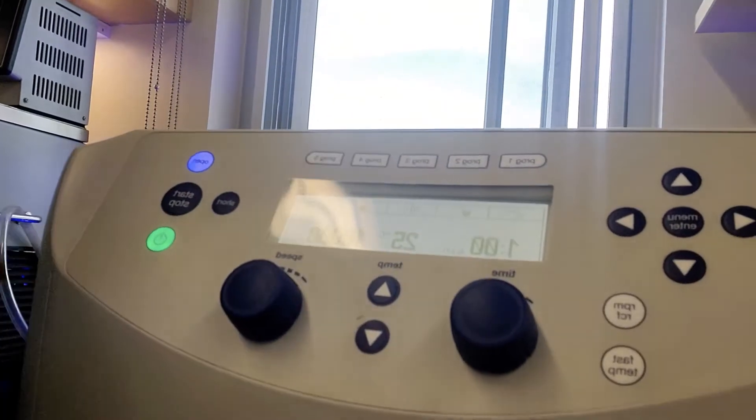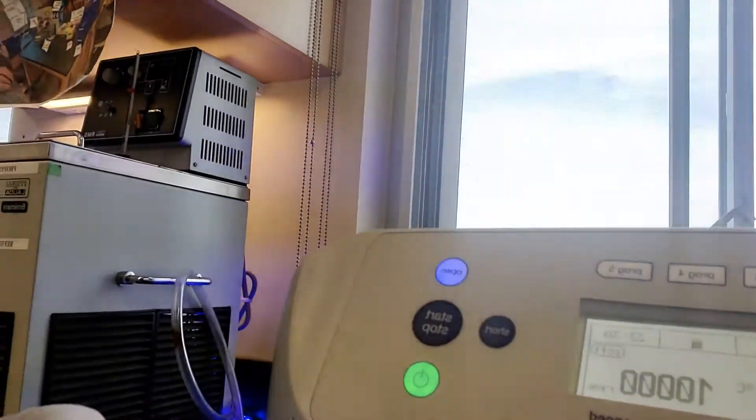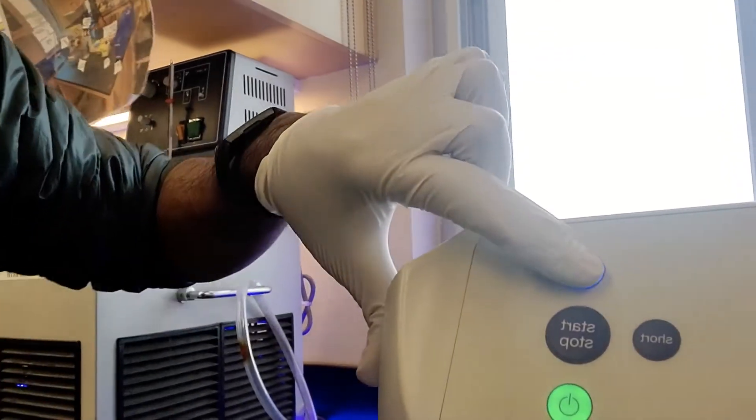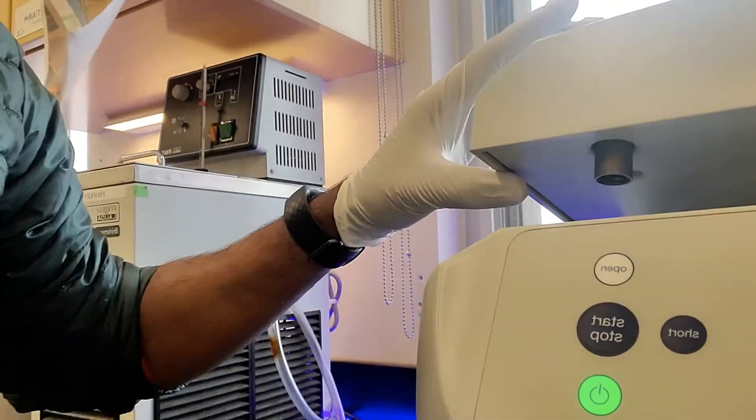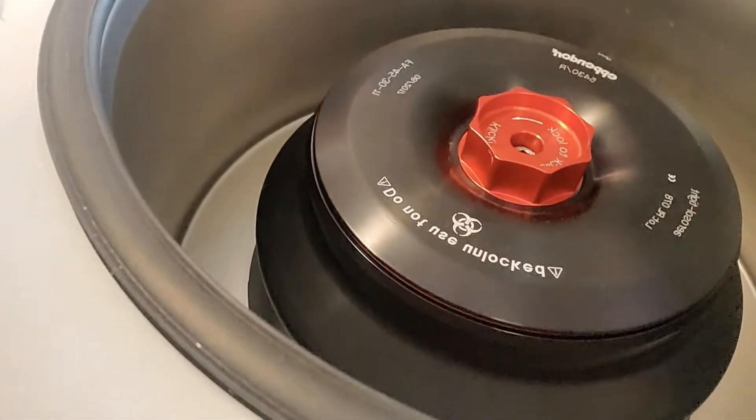I'll explain exactly what that means in a second. If we just walk up to our centrifuge, it's got a bunch of dials on it. The first thing you're going to want to look for is the open button — don't try to pry the top open. Look for that first, and if it's not there, then you can try to open the top. This is kind of what you're going to be looking into.